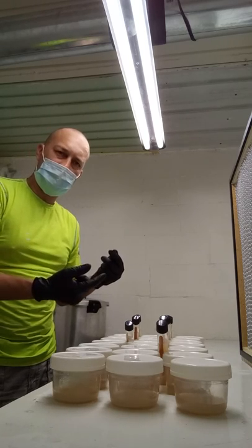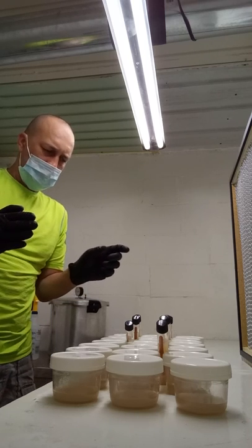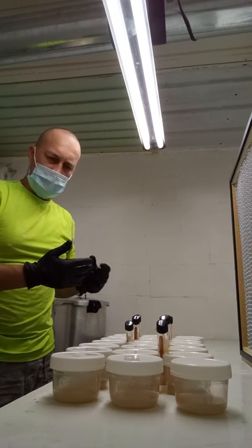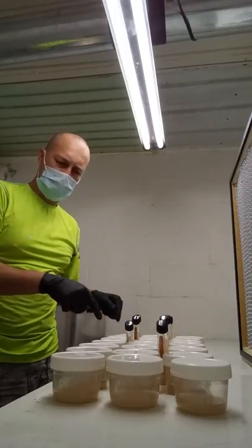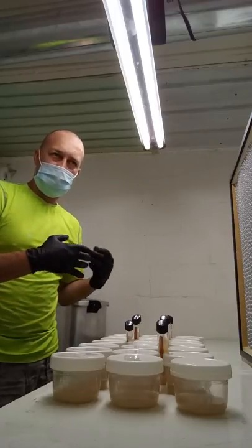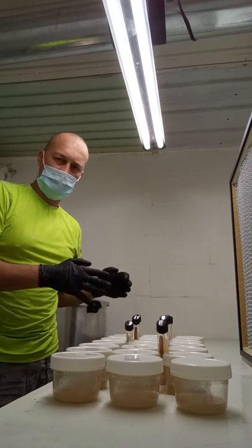Parafilm. If you don't have parafilm, a good trick — shout out to Eric Myers Mushrooms — you take saran wrap and just cut it with a knife into rolls about like that, and you can use saran wrap like you would parafilm. I would use saran wrap only if you're going to be using these within the next week or couple of days. If you're going to store them long term, I wouldn't recommend it. But if you're in a pinch and you need something to keep contaminants out — it doesn't help with gas exchange, but it'll keep contaminants out — as long as you're going to use them within a week or so, you should be fine.